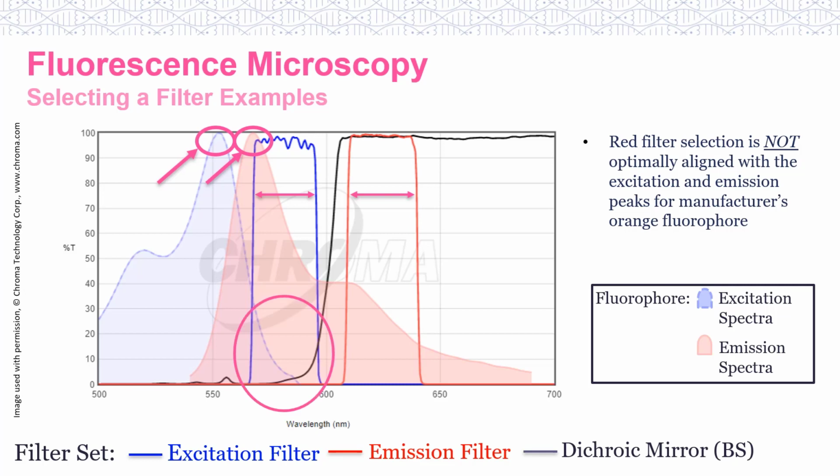As you can see here, there is a very minimal wavelength of the orange spectra that will be excited using this filter set and will ultimately reduce emission. When reading FISH, this will make the signals appear smaller than normal, or possibly even too dim to visualize, and therefore could hinder proper analysis. That is why choosing the filter within the specs that most closely align with your probe manufacturer's fluorophores is recommended.